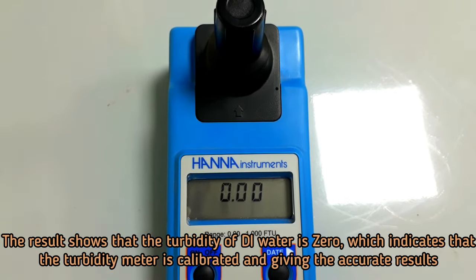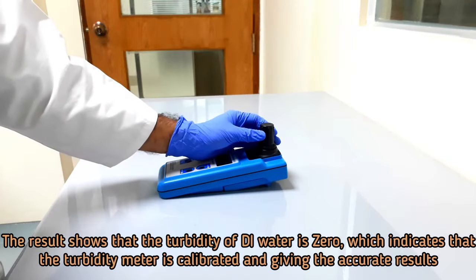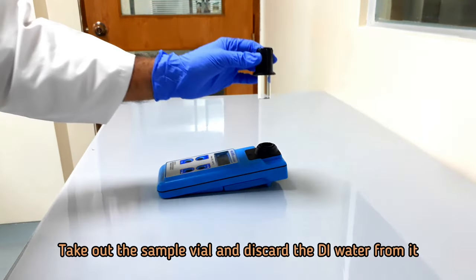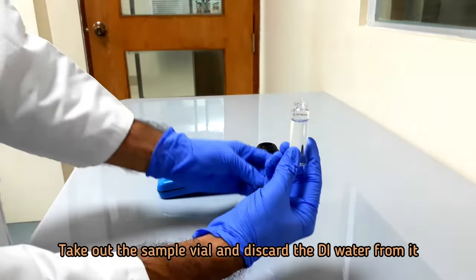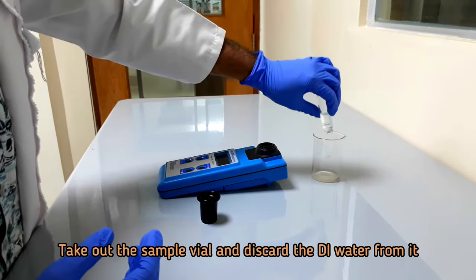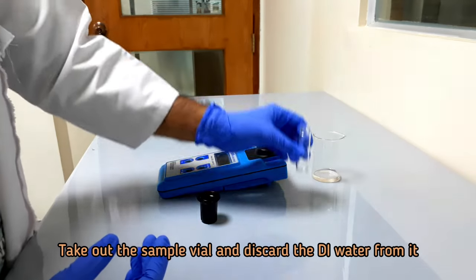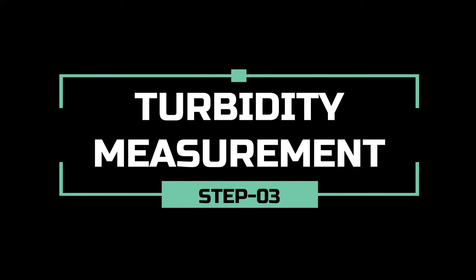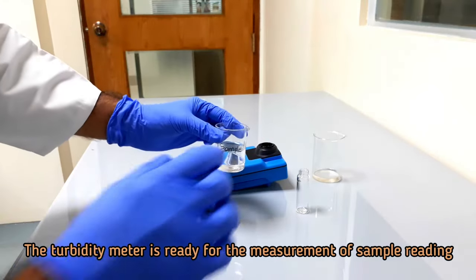The result shows that the turbidity of deionized water is zero, which indicates that the turbidity meter is calibrated and giving the accurate results. Take out the sample vial and discard the deionized water from it. The turbidity meter is ready for the measurement of sample reading.